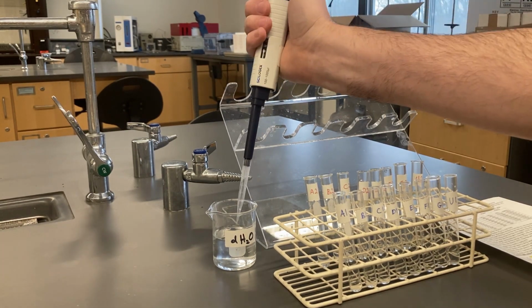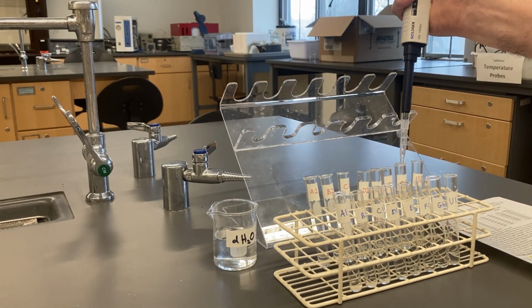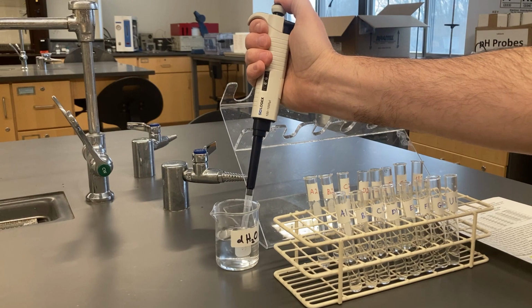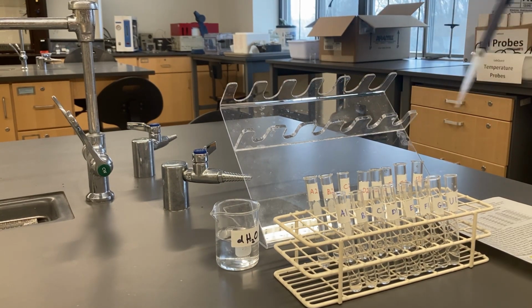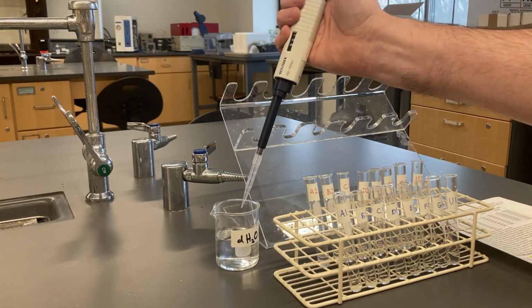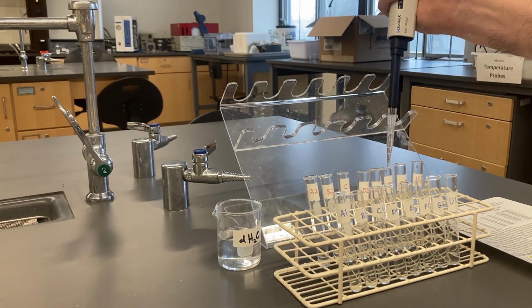I'm going to skip F2 and add 800 to G2 and add 800 to U2. Now I'm going to set it on 600 and add my 600 microliters of water to F2.